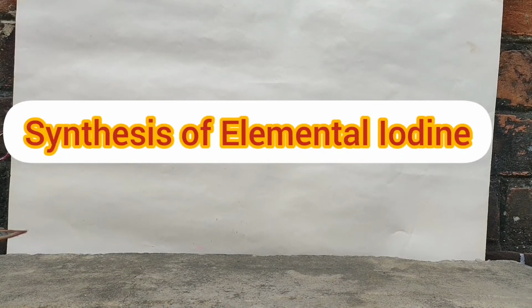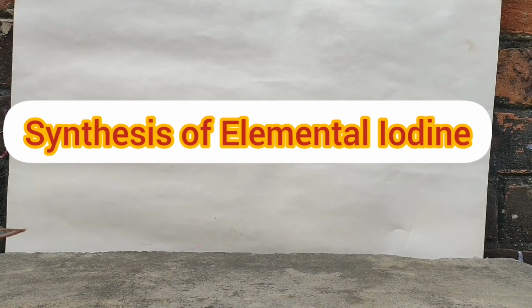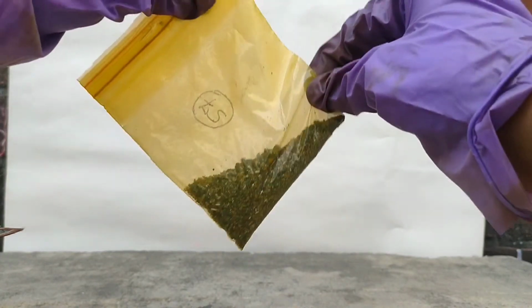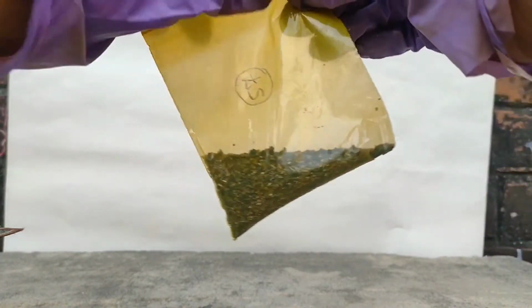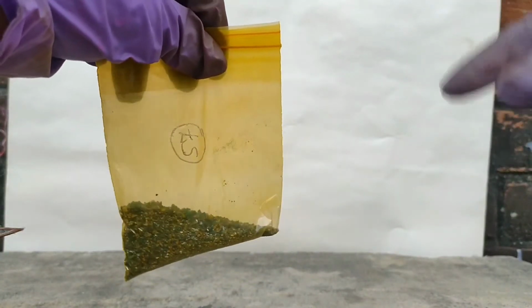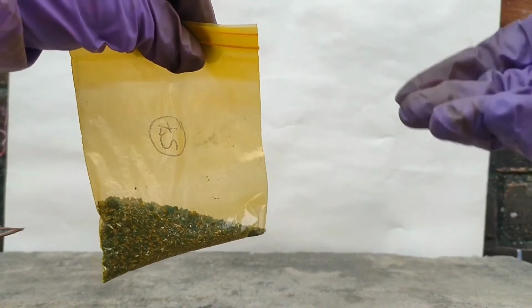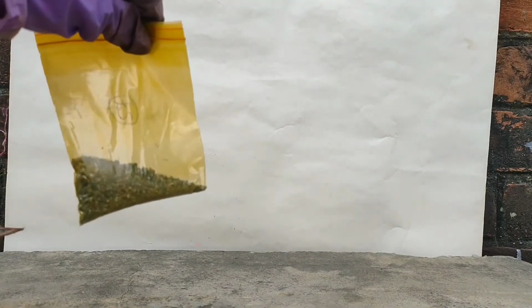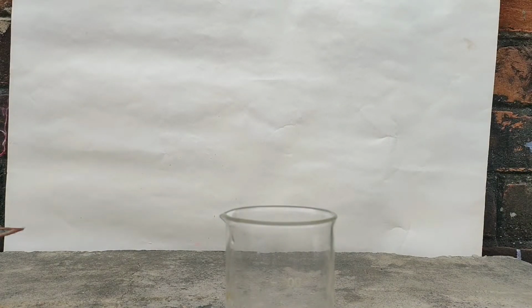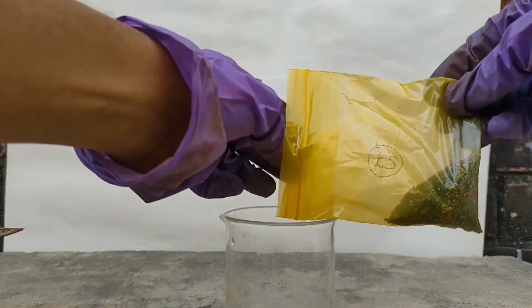So in this video, I'll be preparing elemental iodine from an iodide salt. Over here, I have a mixture of iodide, acetate, oxalate, and sulfate salts. So I'll be using this mixture for my preparation of iodine. The other ions may not interfere in our synthesis, so I'm using this mixture. The mixture is transferred into a beaker.